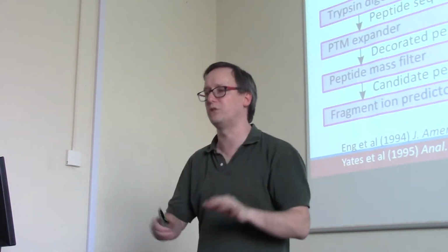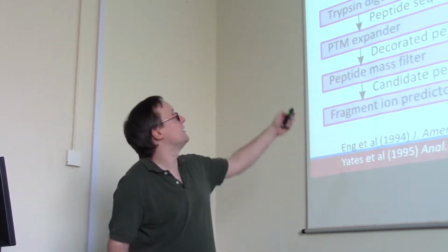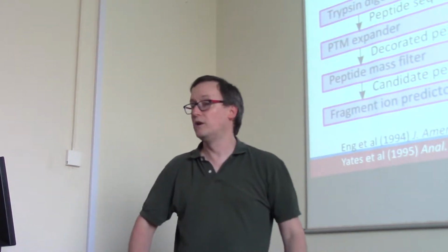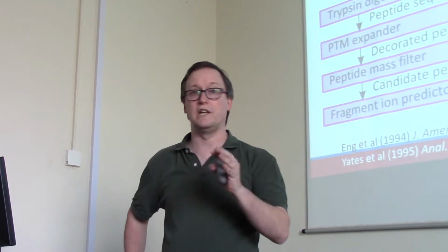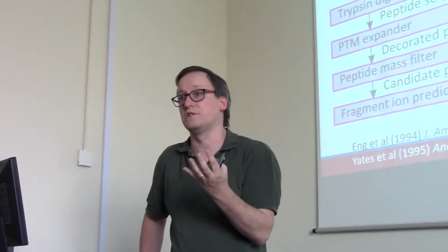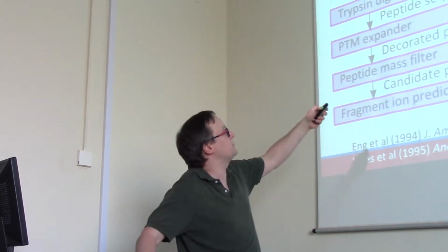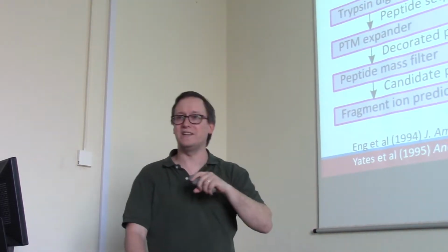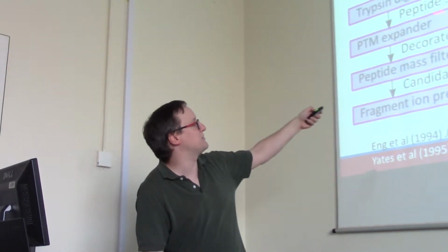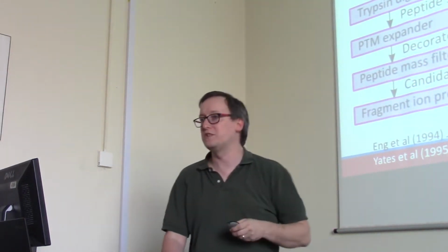It's freakishly terrible. So, let's use software. The software is going to start by looking up the answer in the back of the book. I already mentioned FASTA databases in a lot of contexts. FASTA databases are just long lists of protein sequences. So with these protein sequences, we can emulate in silico, in software, to say what peptides should occur if I'm given these proteins.